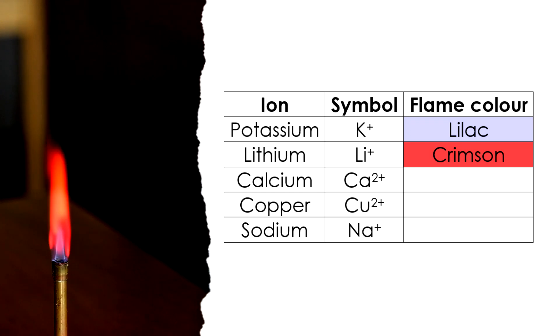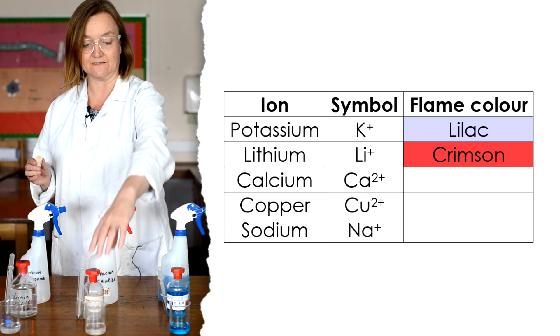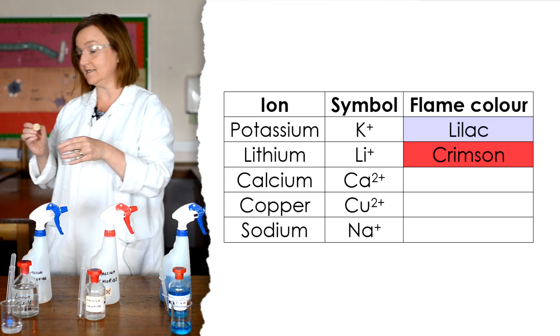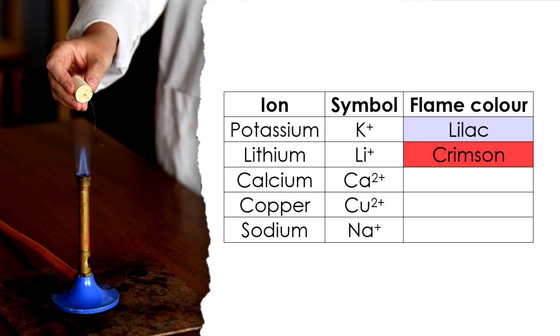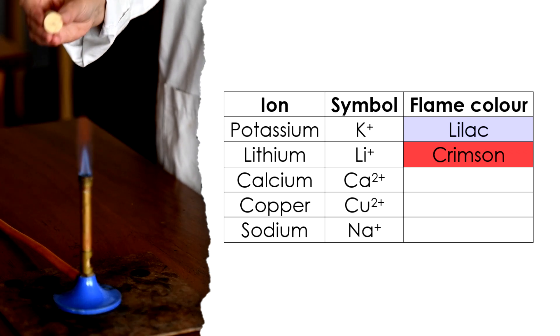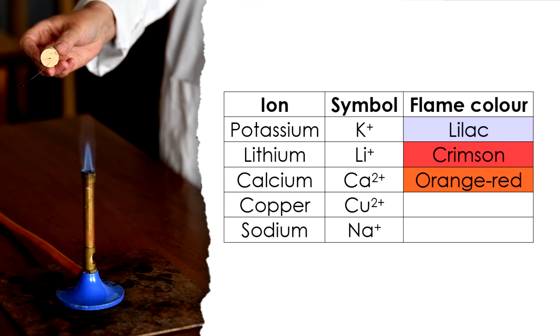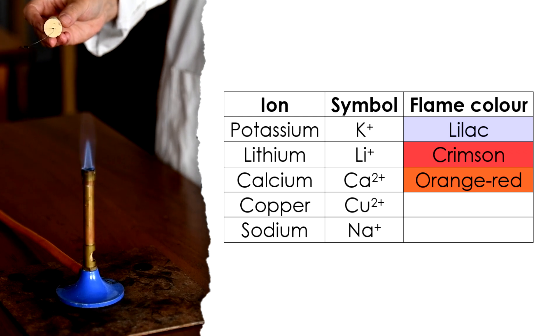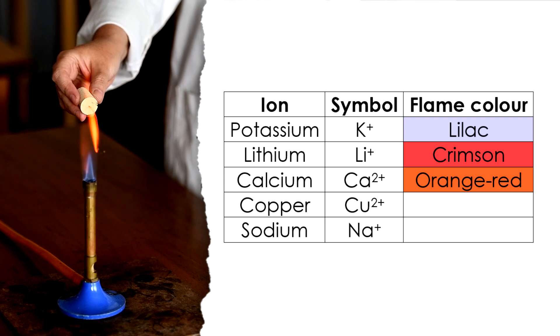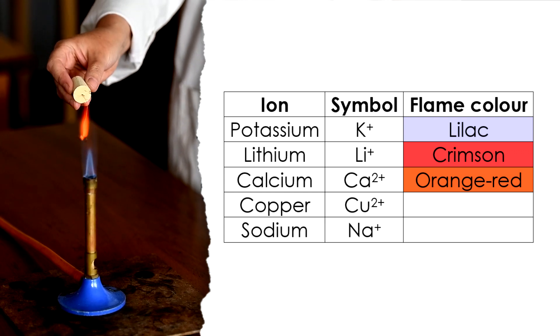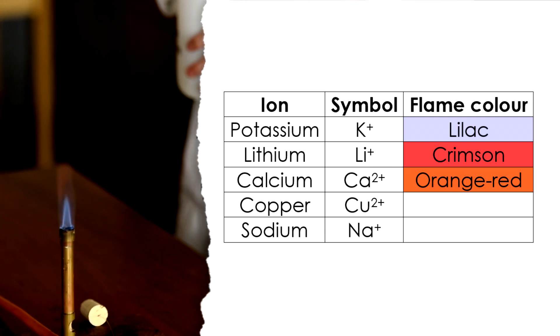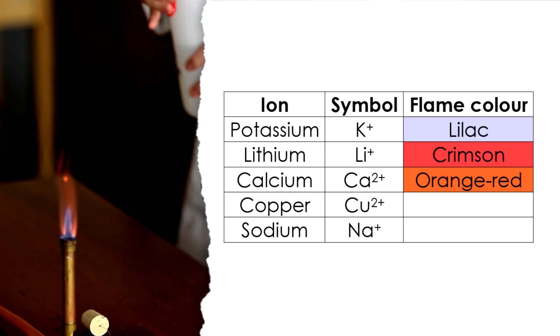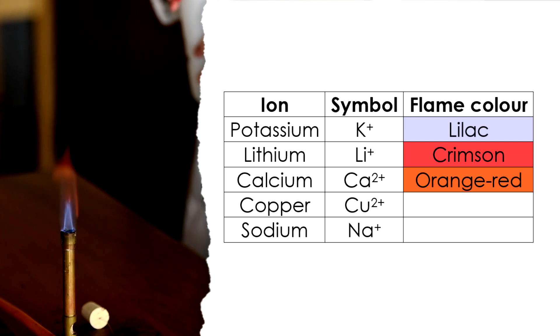Having cleaned my loop again, I'm going to move on to metal number three, which is calcium. The colours are quite similar. Watch carefully. You still get a slight reddish colour, but calcium is described as an orange red flame, whereas lithium is described as crimson red. Make sure you don't get those too muddled in your exam. If we try the spray, we get a much more orangey flame than we did with the lithium.